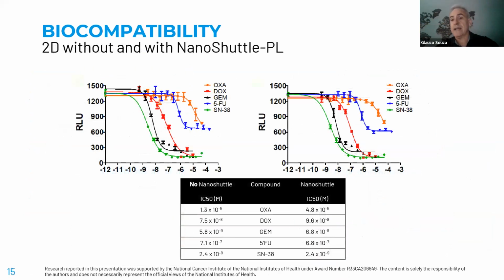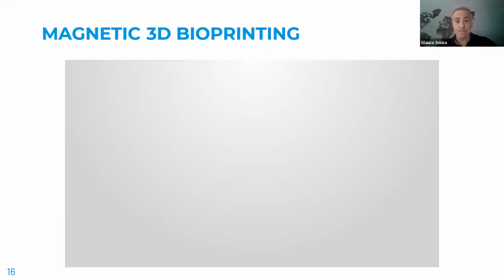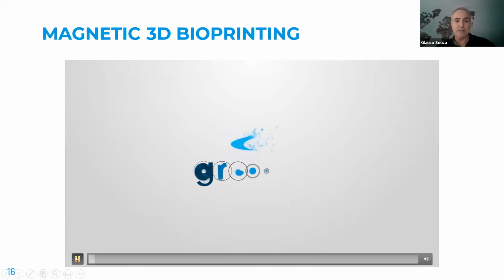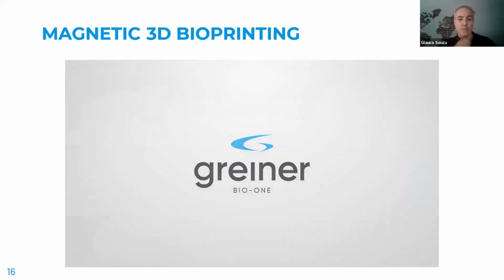We also had, and I'll show some of these results, a big NCI grant with Cold Spring Harbor and Scripps to optimize high throughput tools. When we did that work, we compared nanoparticle and non-nanoparticle with control cells and control compounds, and the results were the same. So if you want a quick idea of how the magnetic 3D cell culture works hands-on, here's a quick movie.